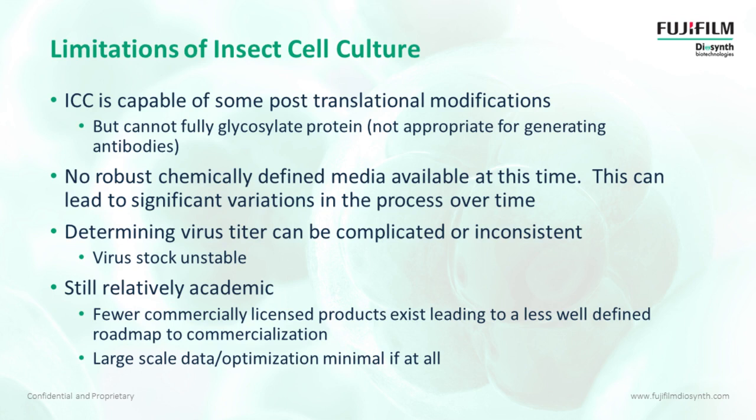Determining virus titer in insect cell culture is also very complicated and can be inconsistent. A lot of times virus titers are done through some sort of growth assay, and those can be very variable over time. And a lot of times the viral stocks are unstable, or they don't have a long lifetime in storage.